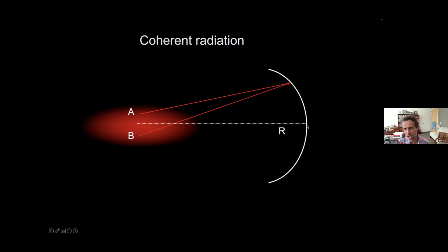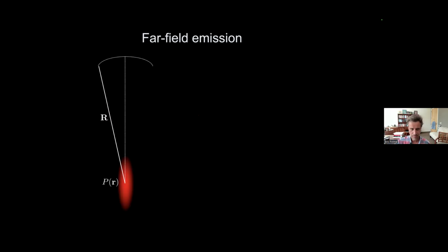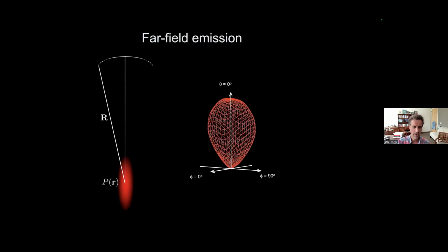The more you move away from the center position here to the outer edges, so larger angles, that means that the chance is way higher that your two photons from two different positions will be out of phase. This is an effect that doesn't play any role in fluorescence microscopy, but it does play a role in coherent microscopy. So if I now do the following, I'm going to just walk across this hemispherical detector at all points and see what is the intensity that I can find if I add up all the molecules in this cigar that start to radiate, okay?